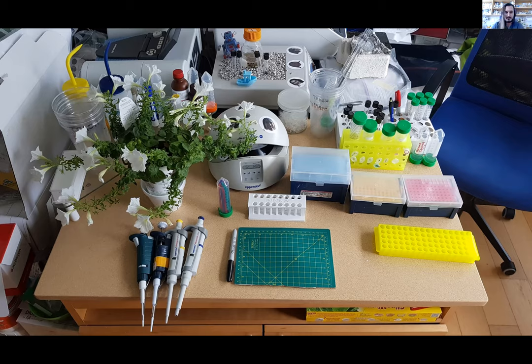So here's basically a slight little diatribe on patents and how to break costs, essentially. We'll start with this. One of the simplest devices I've made was literally just a bunch of LEDs plugged into a USB. It's a blue light transilluminator. It's used for visualizing agarose gels in order to do molecular cloning, right?